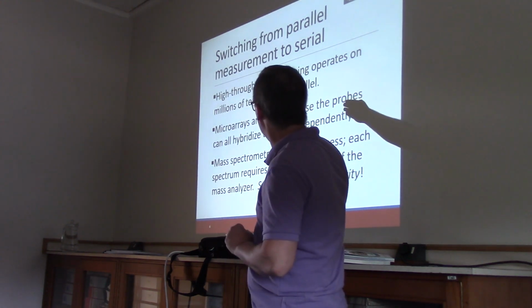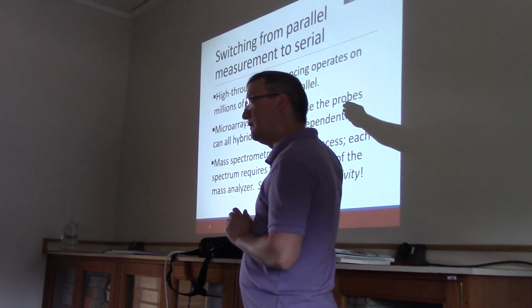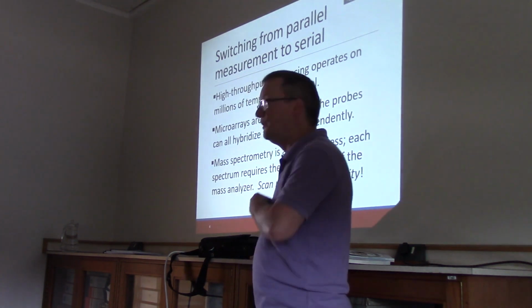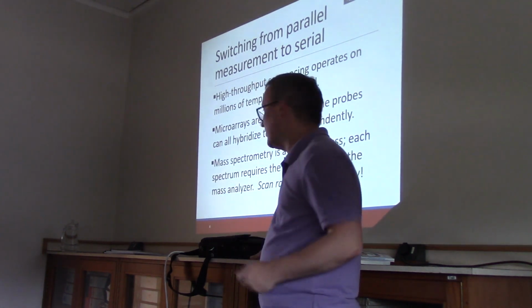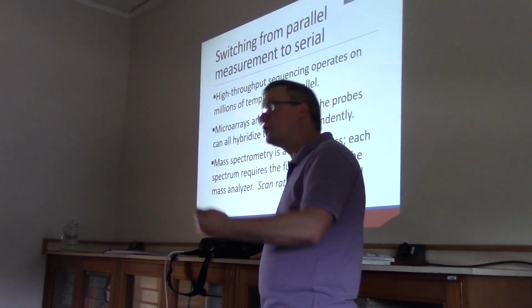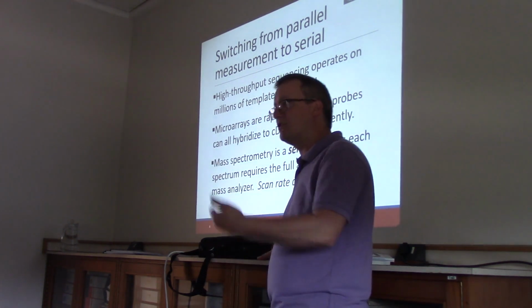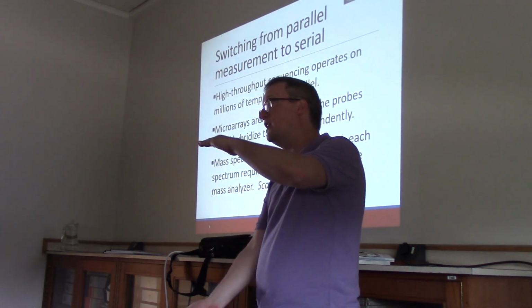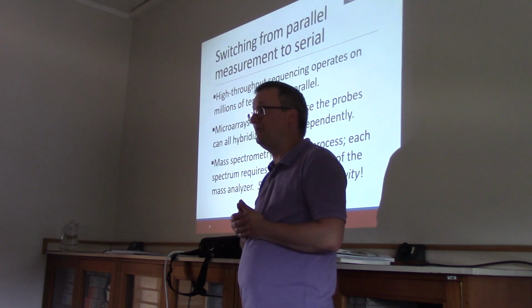So, we're moving away from a scenario where all the data are collected in parallel to one in which the data are collected serially, one after the other. So if you have an instrument that can generate a very large number of tandem mass spectra in a given second, then you're going to have a better ability to get a very sensitive appraisal of whatever peptides are visible in the cell.